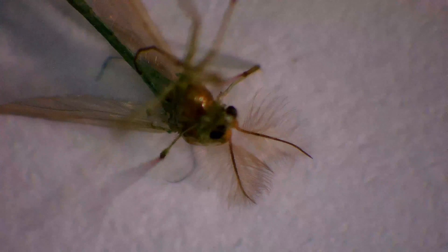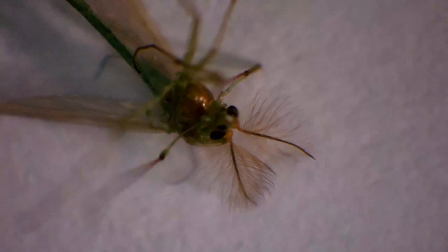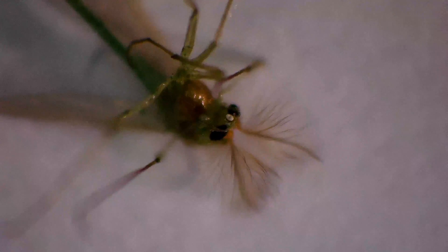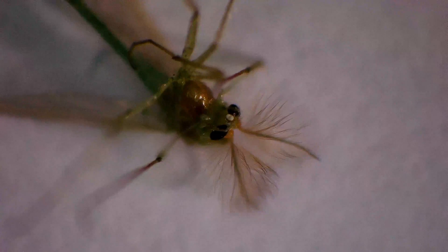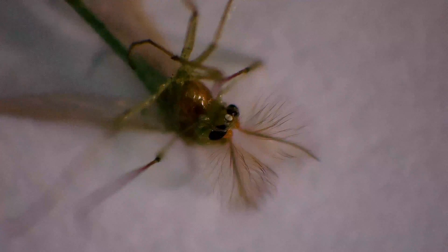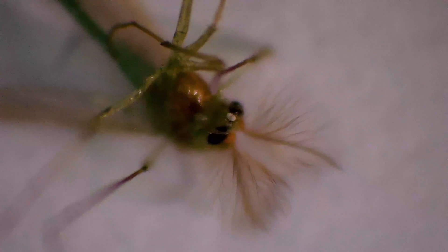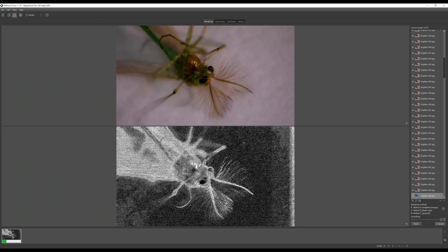I will show you the simplest method I know. I make a video where I go through the whole depth of field while filming, then extract the video frames as images and stack them in the program Helicon Focus 7. Here I made a short sequence of video going through the whole depth of field at maximum zoom with the microscope lens. It produced a total of 237 video frames that I combined using Helicon Focus 7. The program finds the sharpest piece from every frame and combines them into one final sharp image.